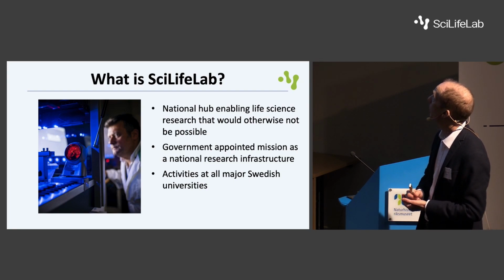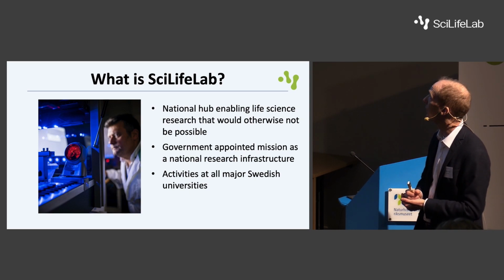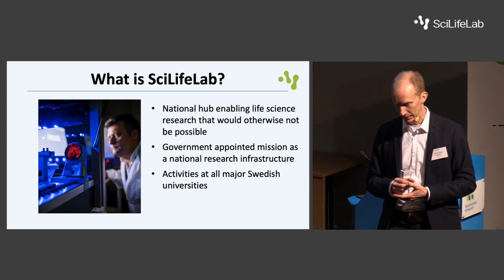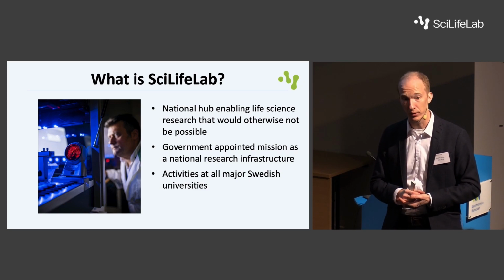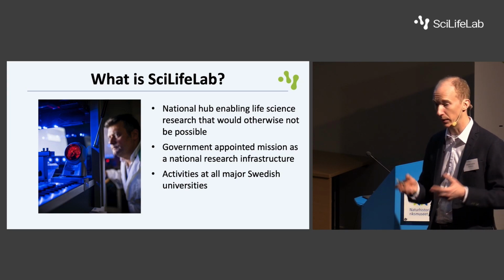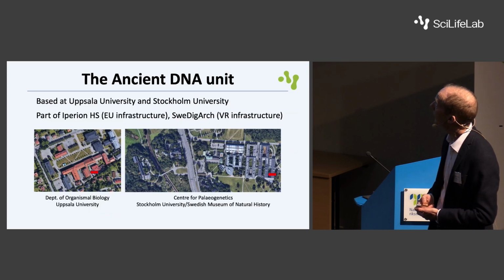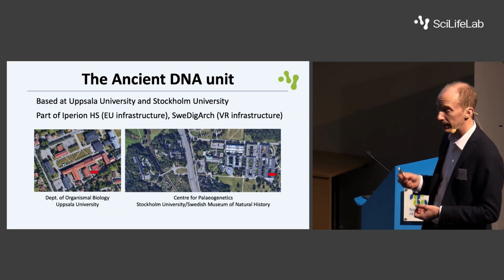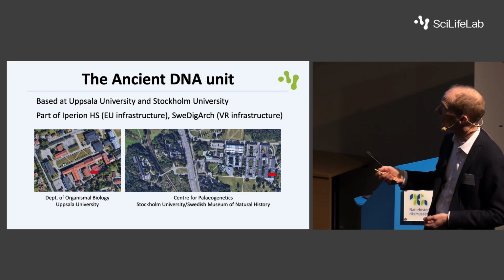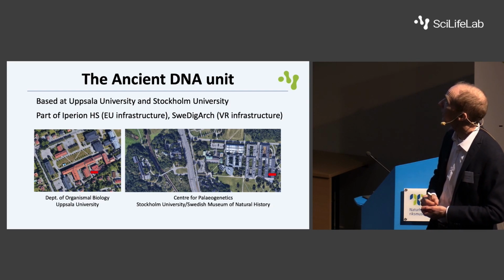So it's a government-appointed mission to provide research infrastructure in this field. And it's highly distributed. You can find probably various types of SciLifeLab units at all major universities in Sweden, specializing basically depending on what knowledge there is at that particular given research environment. But the Ancient DNA unit is based at these strong Ancient DNA research environments here in Sweden, at the Department of Organismal Biology and at the Center for Palaeogenetics here in Stockholm.